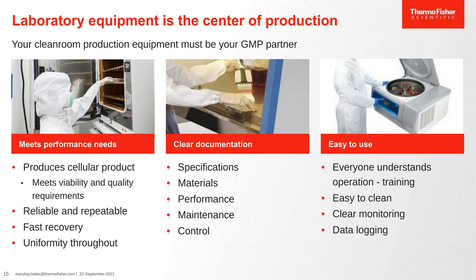It includes performance. As I said, it needs to perform in the same way reliably and repeatably. You need to understand the maintenance that's required as you go through the process as time passes by. And everyone needs to understand the control of that equipment. You need to be able to monitor it from across the room. The equipment needs to be easy to use. Everyone using or operating that equipment has to understand how it works, and that extends to training and refresher training. The equipment has to be easy to clean.